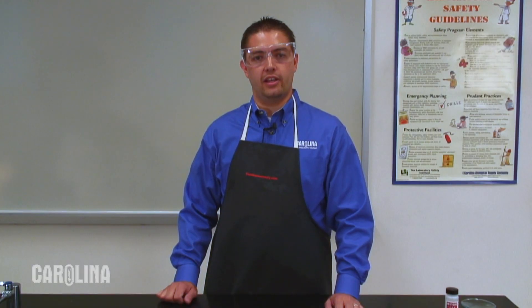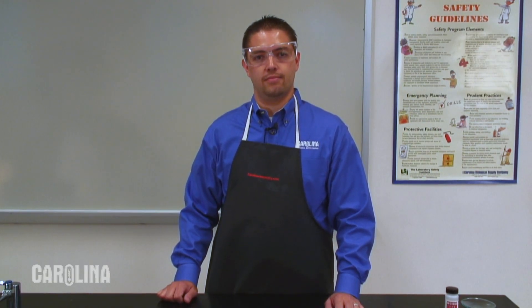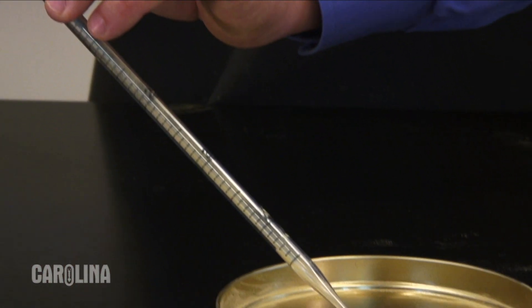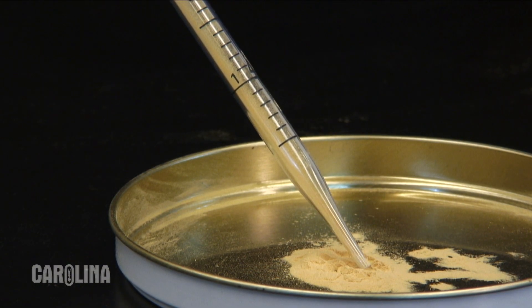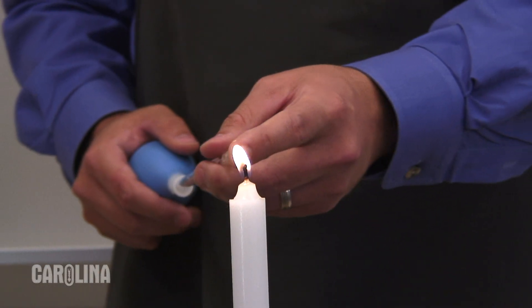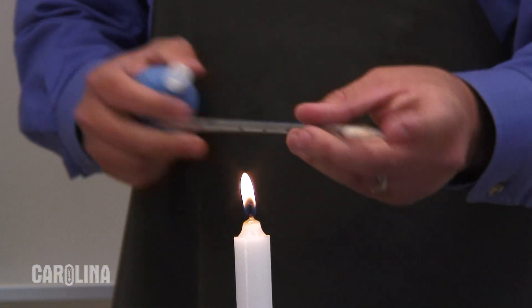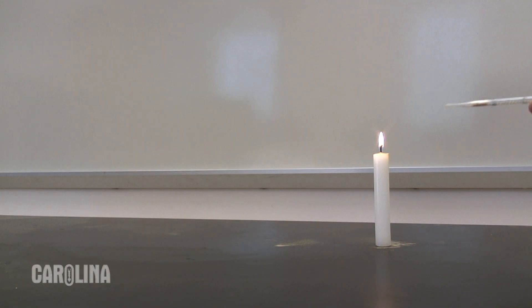We can increase the availability of oxygen for this reaction by forcing the lycopodium powder into a mist in the air. To do this, we will fill a pipette tip with a small amount of the powder by placing the tip into the lycopodium from the previous step, and using a rubber bulb to collect the powder into the pipette. With the bulb on the end of the pipette, hold the pipette tip near a candle flame and gently squeeze, forcing the powder into the air around the flame. It is important not to point the pipette in the direction of any spectators, as the flames may extend several feet. Clearly from this demonstration, we can observe the effect of excess oxygen on a combustion reaction.